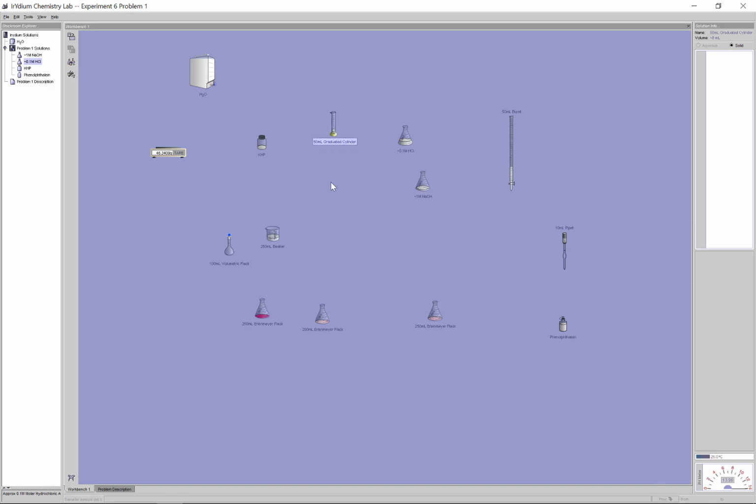Again, the most accurate piece of glassware for doing a dilution is a volumetric. So let me just pull out a volumetric here. Could be a different shape, could be a different size as well. But let's just transfer in these 8 mils into the volumetric here. Let's pour it in completely. So I know it's roughly 8 milliliters. I'm going to then use my vat of water and I'm going to dilute it up to the mark. I know I have upwards of about 100 milliliters before it gets to the line here.